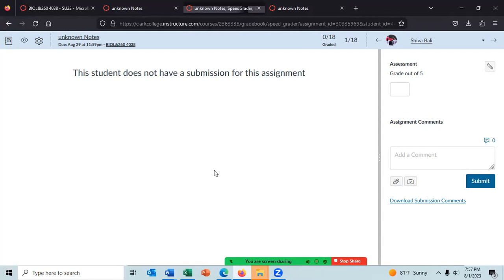If you have the catalase test, you can get that one right away, assuming you have the cells. You can get the catalase test results right away. Most of the tests require 2 days of incubation. So once you request the test, you will not get the results for at least 2 days. Some tests require 5 days, and the gelatin hydrolysis has a 7-day incubation period. Any question about that?